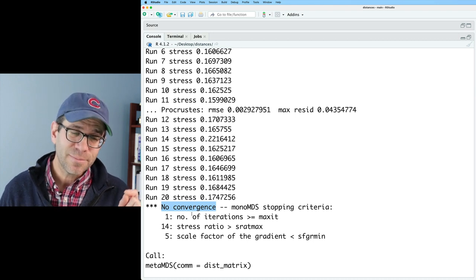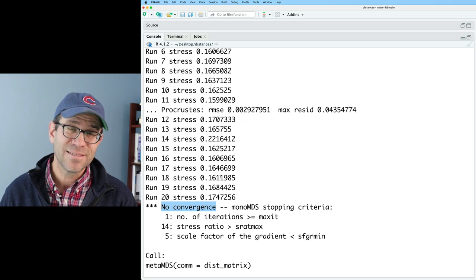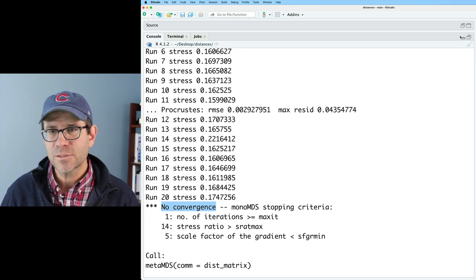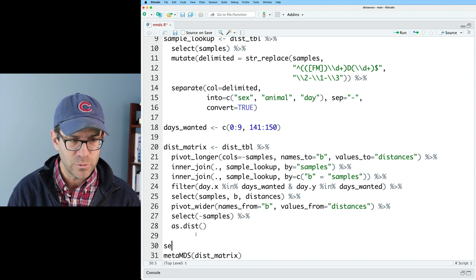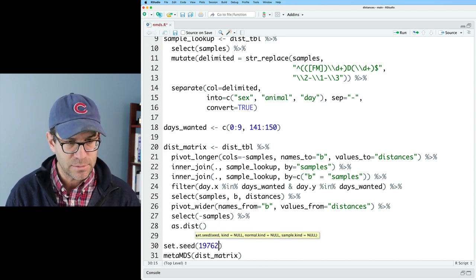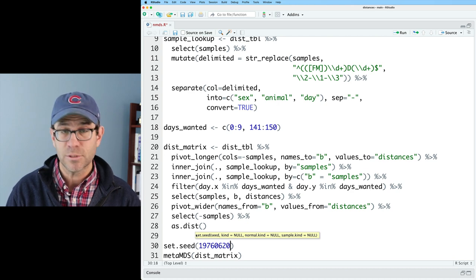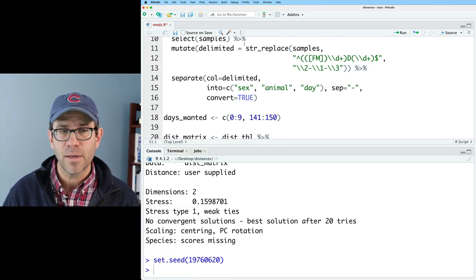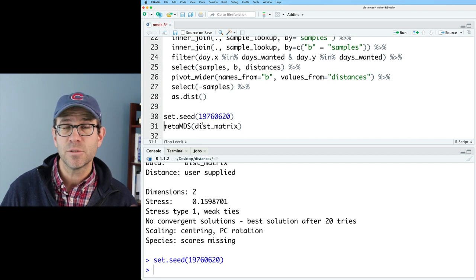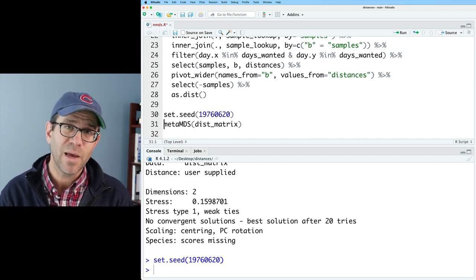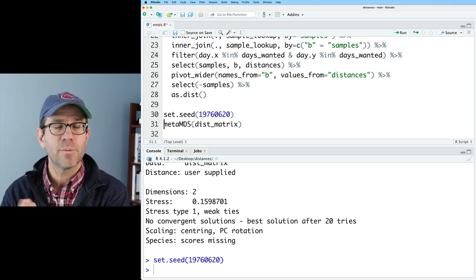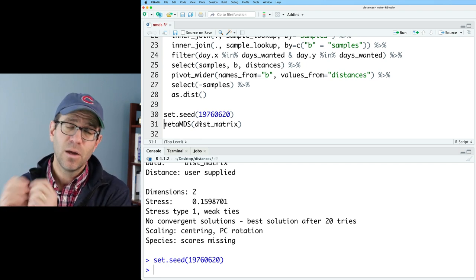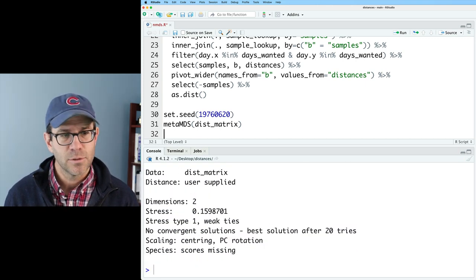What the documentation suggests is setting a seed, and setting a seed so that you get convergence. So let's go ahead back up into our code and do that, and we'll do set.seed, and let's start with my favorite, 19760620, which is my birth date, and so we're setting the seed of the random number generator that is used by metaMDS, and that's always a good practice to get into anyway, because it will ensure that the downstream analysis from that set seed will be reproducible, and in fact, you should get the same output that I get.